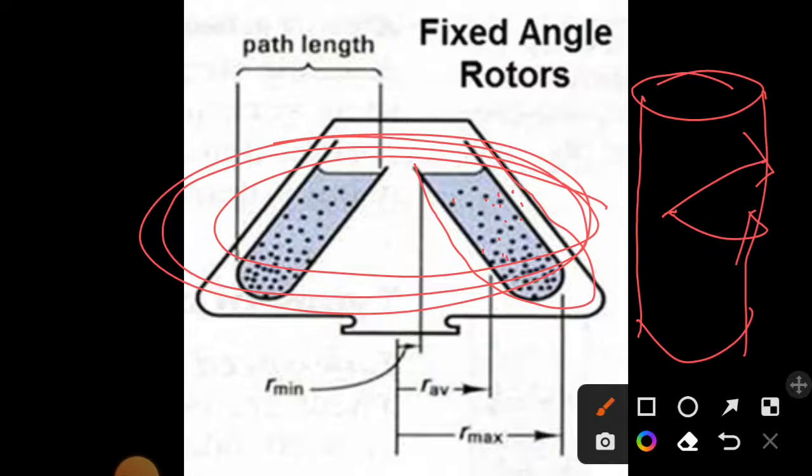Okay, as a result they are not pelleted, because remember, centrifugal force helps us to separate the molecules, right? But here the particles inside the mixture are striking at the opposite side of the direction of the force. As a result, only the particles that can slip down from that side of the tube to the bottom will be pelleted with the help of the fixed angle rotor. Otherwise the remaining particles will remain at the side of the tube. Okay, they cannot be separated.